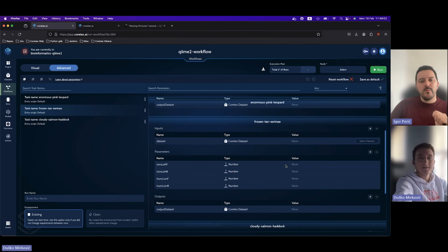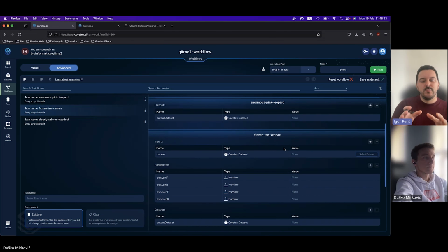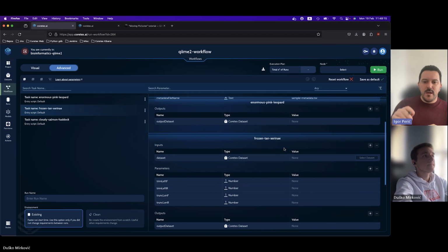And I think it's a very good moment to briefly tease and show how parameter optimization is done. We won't run it right now, but let's say you don't know the actual good value for one of these parameters.